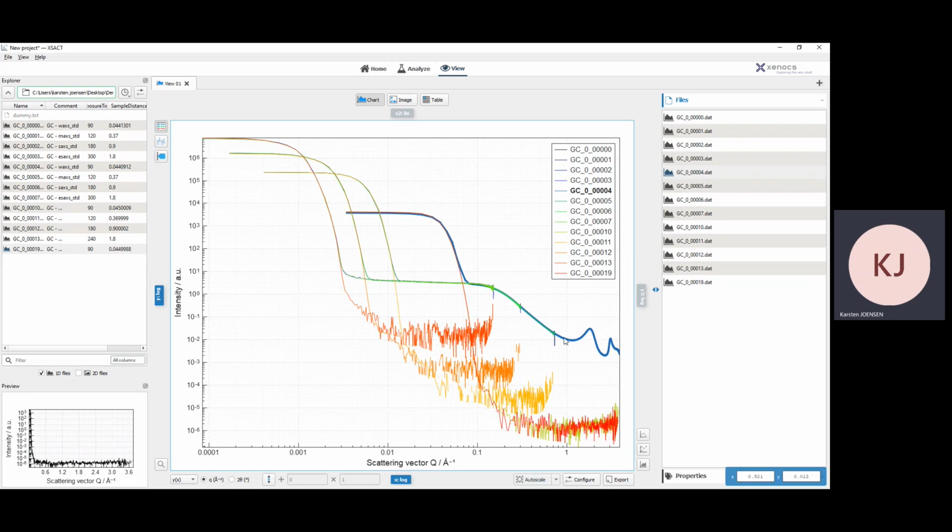One can just take a look at this and see that the sample scatters a lot more than the direct beam. And in addition, one can see that these data overlay quite nicely, which is how this system works as we normalize with the incoming intensity. Now, all of these have different intensities, different configurations, and also different resolutions in them. So that all plays a role in it.